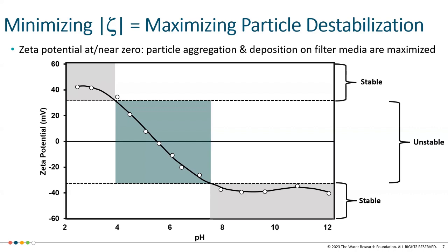Inert surfaces thus are negatively charged at neutral and higher, or more alkaline, pH. It is only at lower pHs where the concentration of hydronium ions in water becomes more dominant, and in those cases, inert surfaces exhibit positive surface charge. So this is the nature of a particle being in water.